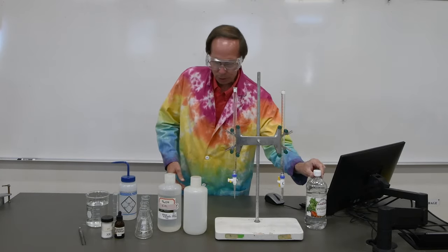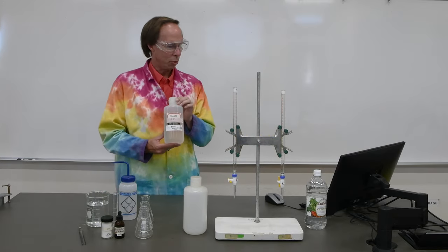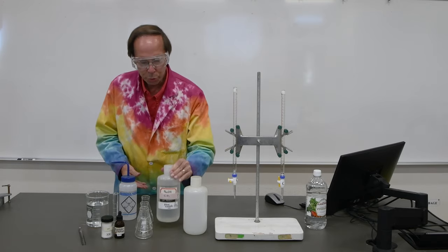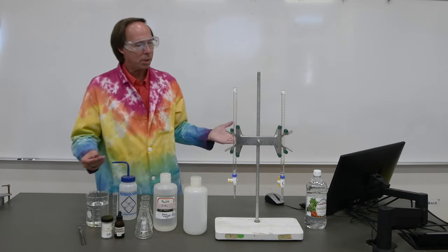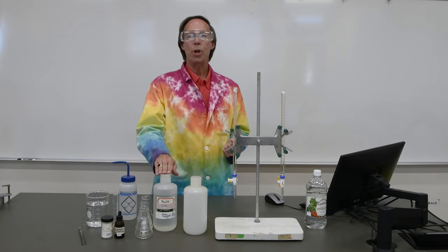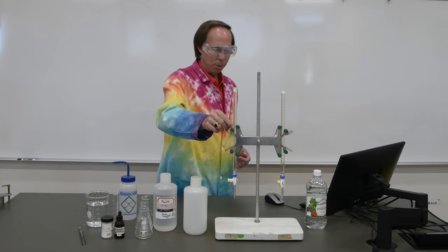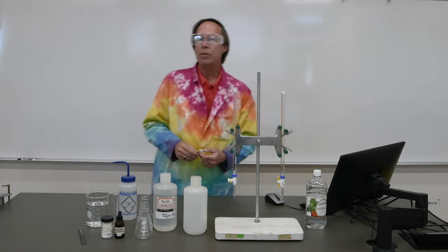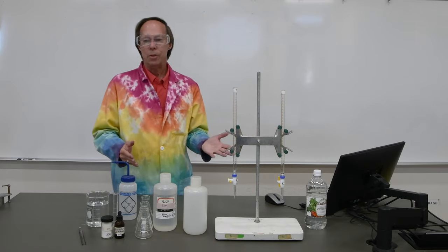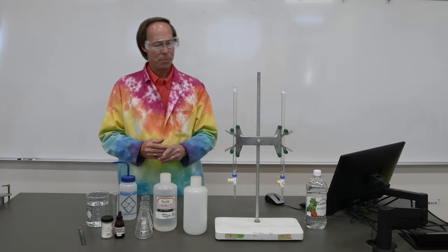We're going to titrate it by adding to it sodium hydroxide. Sodium hydroxide is a base, acetic acid is an acid, so the two will neutralize each other. And like we did in our previous titration, our sodium hydroxide solution will have a known concentration, and we're going to add that to a sample of vinegar using our burette so that we can measure precisely how much of the sodium hydroxide is required to neutralize the vinegar.